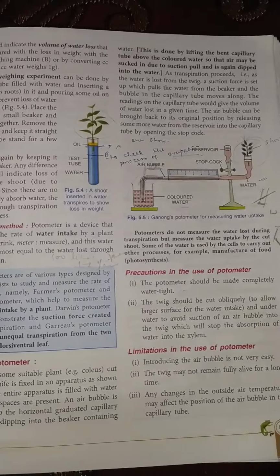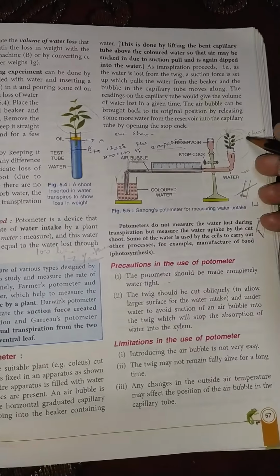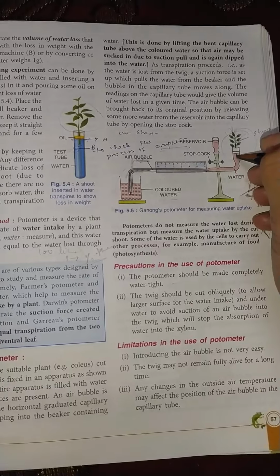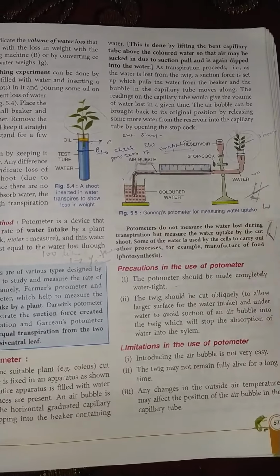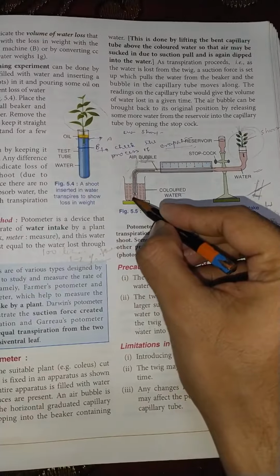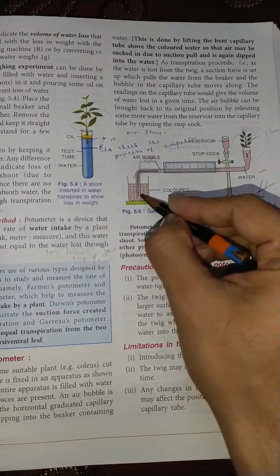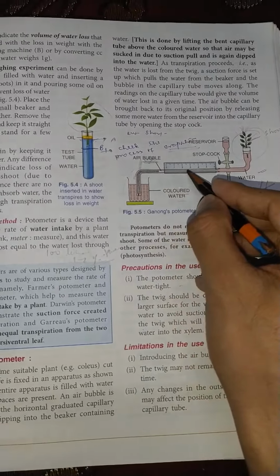That is the main concept, that is the main principle behind this whole setup. So the suction force created due to the transpiration, that suction force will be created in the stem. After that, since the stem is connected with the capillary tube, the suction force will also be created in the capillary tube. For that reason, the water will move inside the capillary tube, and with the water the air bubble will also move.